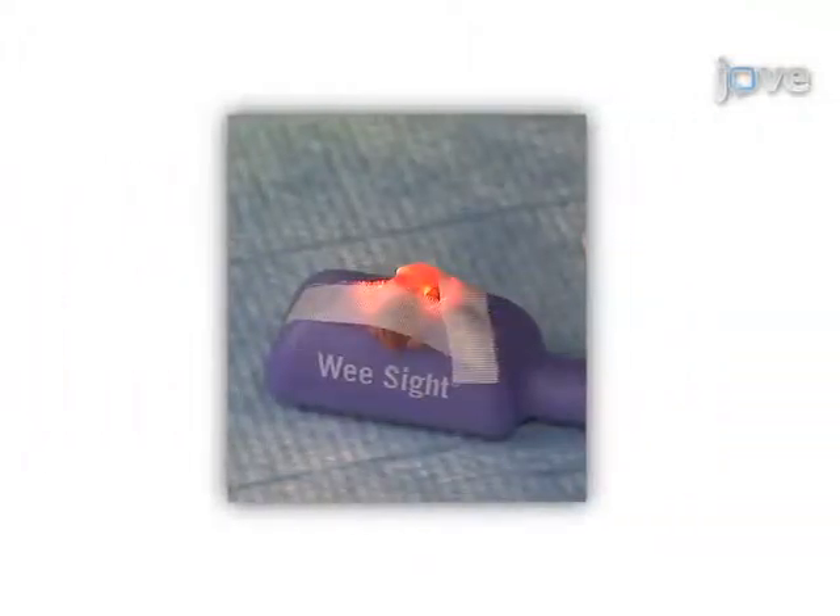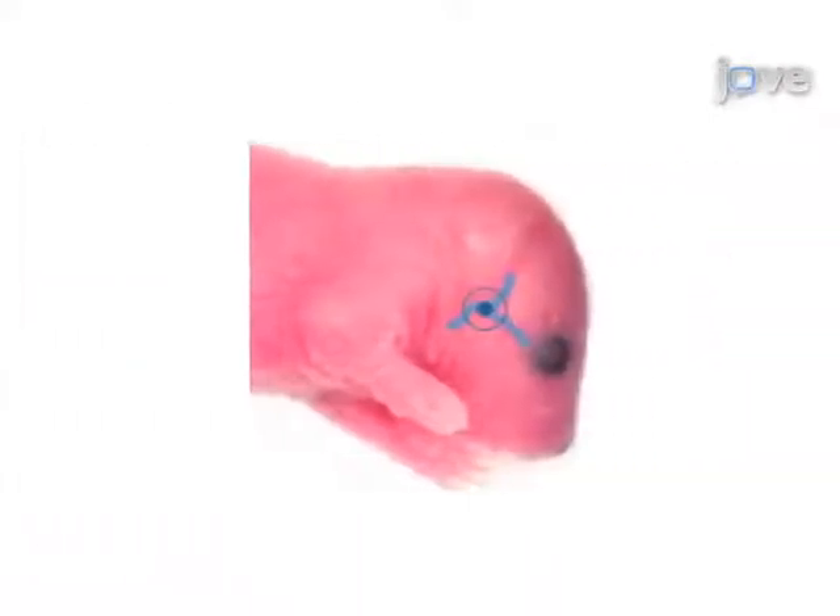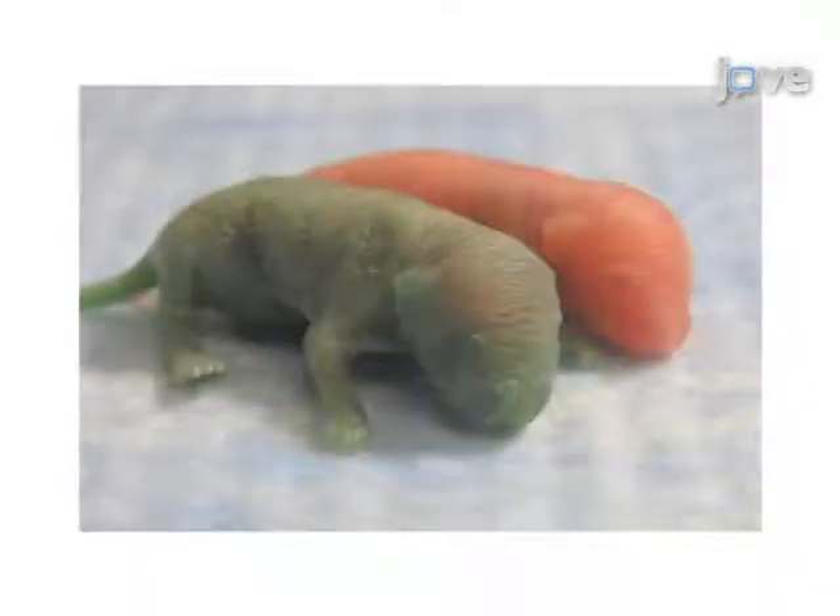For intravenous injection, the mouse is secured to a transilluminator in such a way that the facial vein is exposed. The inoculum is then slowly injected directly in the vein and becomes distributed systemically.